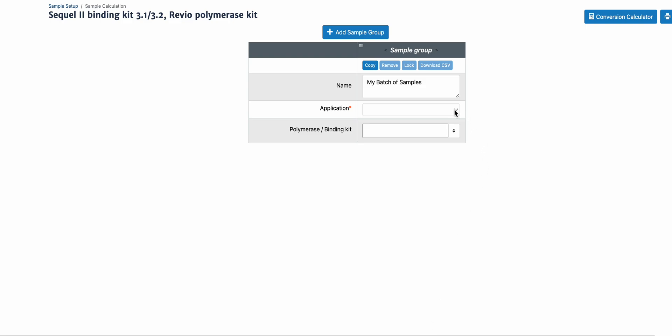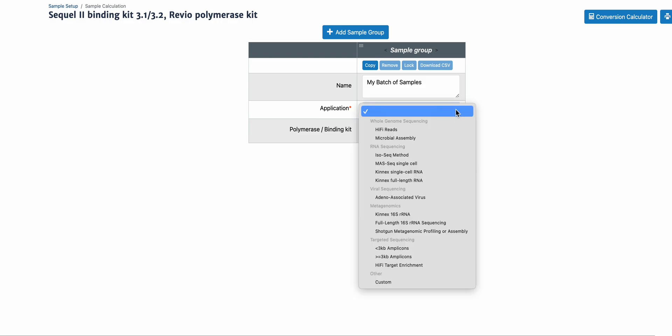In sample setup, in the application drop-down menu, you'll see three Kinex applications: Kinex single-cell RNA, Kinex full-length RNA, and Kinex 16S RNA.